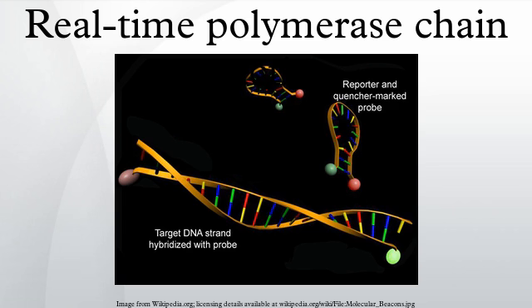Estimation errors arising from variations in the quantification method can be the result of DNA integrity, enzyme efficiency and many other factors. For this reason, a number of standardization systems have been developed. Some have been developed for quantifying total gene expression, but the most common are aimed at quantifying the specific gene being studied in relation to another gene called a normalizing gene, which is selected for its almost constant rate of expression. These genes are also called housekeeping genes as they are usually involved in the functions related to basic cellular survival, which normally implies constitutive gene expression.